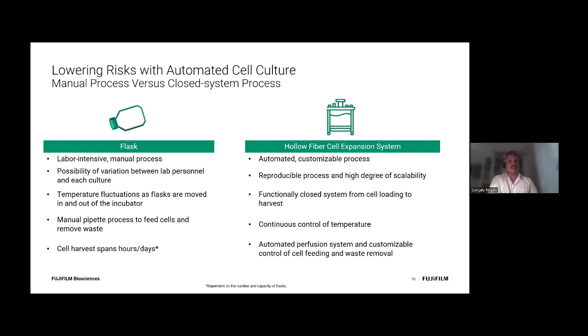plates and flask biology, which is very labor intensive. It's really locking in a biology that in the end is going to be really hard to scale. In our hands, we are big fans of hollow fiber bioreactors. We do think from a T cell perspective, they lead to semi-physiological ways for these cells to grow in the fibers, leading to high densities and optimal phenotypes as far as T cells are concerned. But there are many options and different strategies.